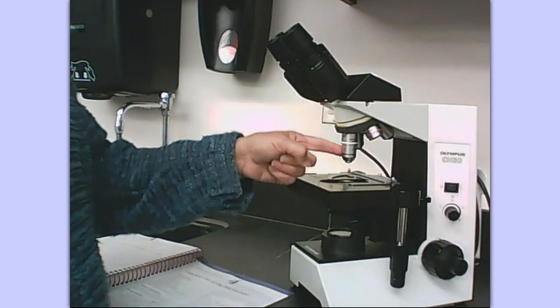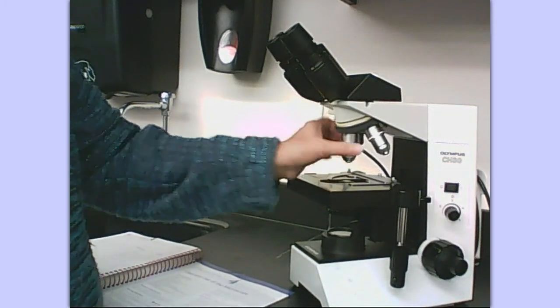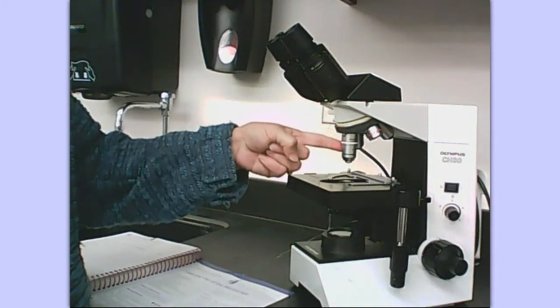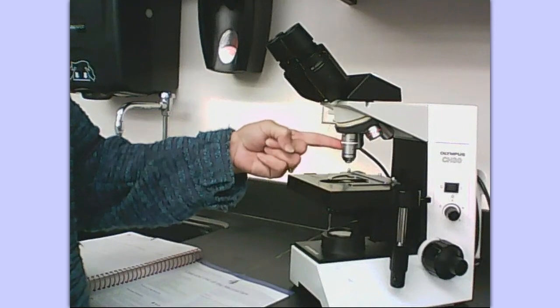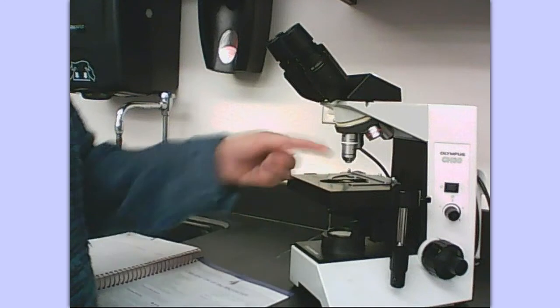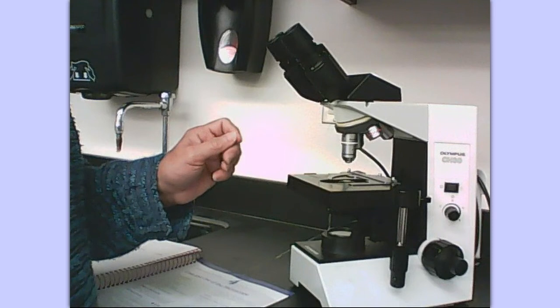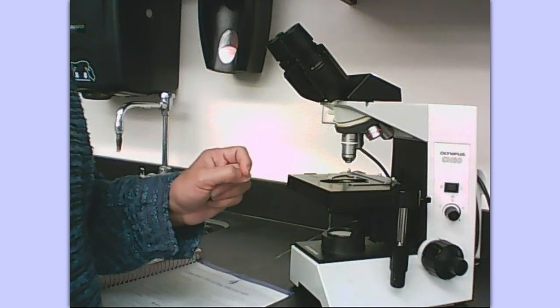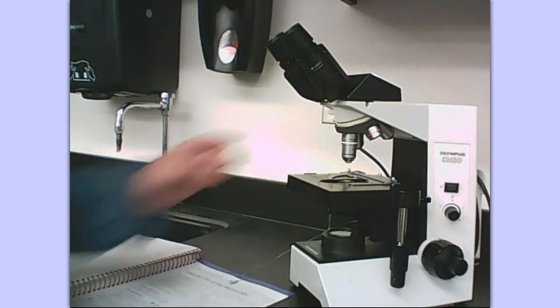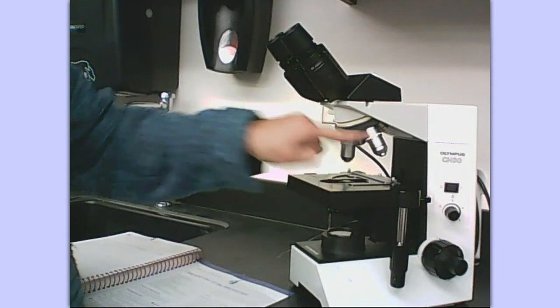We don't use that one, so I will not ask you anything about the oil immersion objective. If you're ever physically here in the lab, you will never use this, and if it is locked into place when you rack that stage up, you could break a slide. If you don't use oil, you cannot get it into focus — it will be blurry. It's not worth trying, and it wouldn't be a true 100x because the oil helps with that magnification.